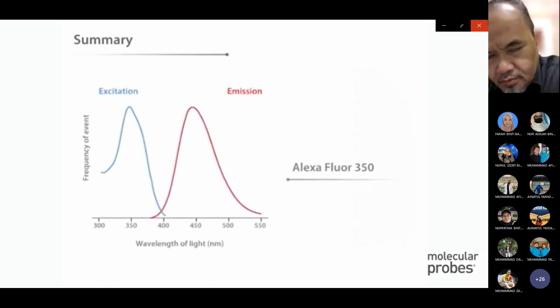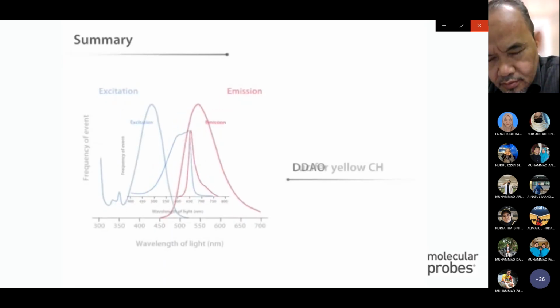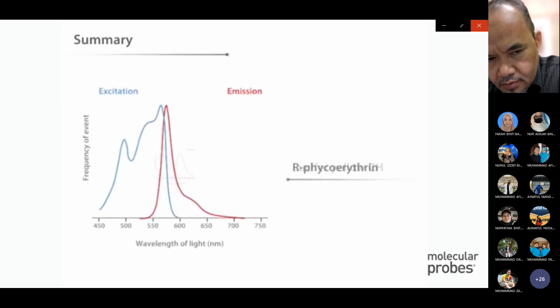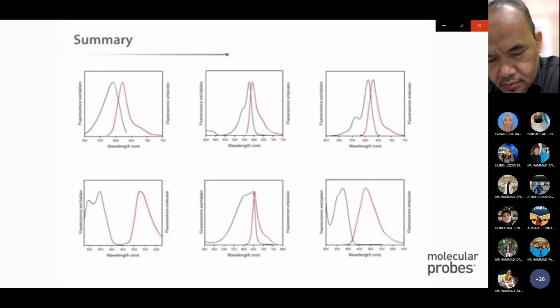In summary, the excitation and emission spectra of a fluorophore contain important practical information about what wavelengths of light we need to supply and detect in order to use that fluorophore effectively. In addition, excitation and emission spectra must be examined carefully when choosing two or more fluorophores to use simultaneously in an experiment, so that the fluorophores can be excited in a manner that will generate distinct emissions.